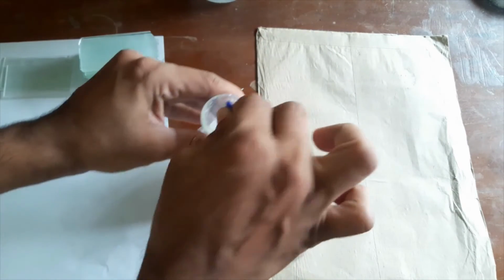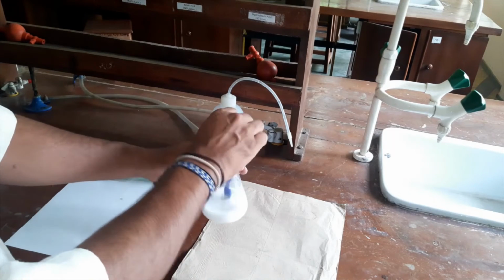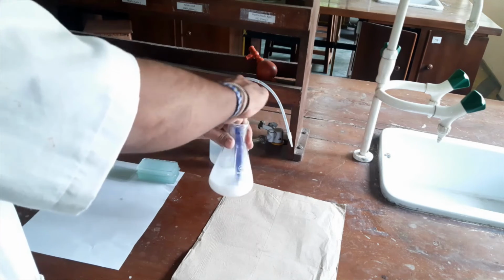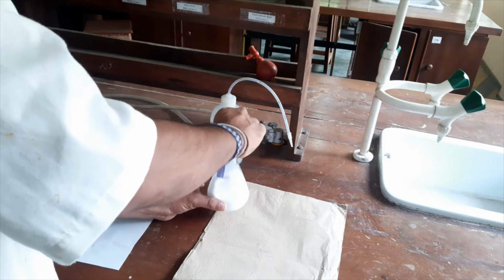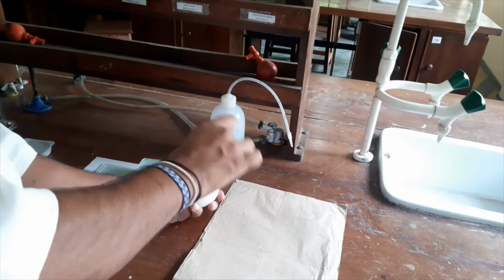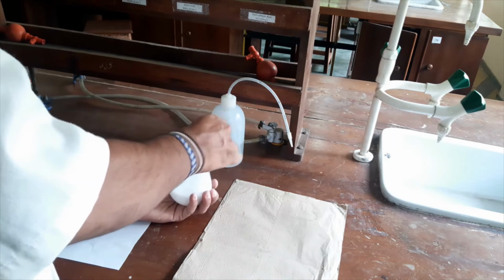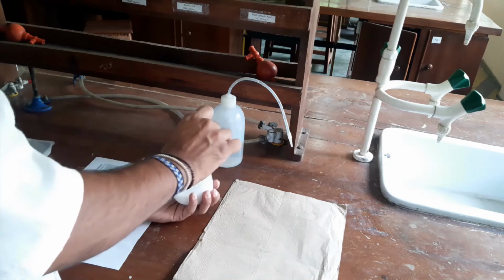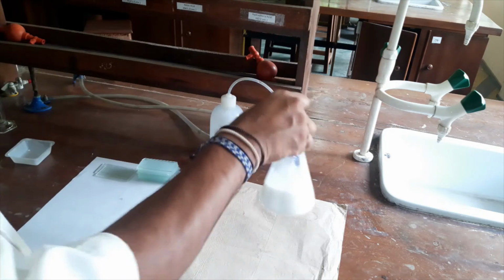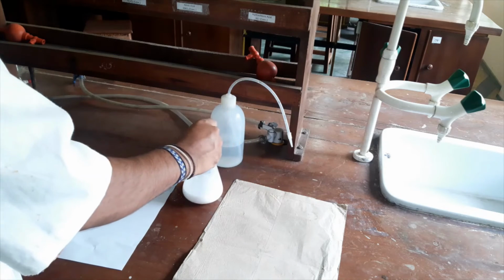You can see, actually it's a paste, silica gel paste, very viscous. Like this way we can mix it very well. Okay, now the paste is ready.